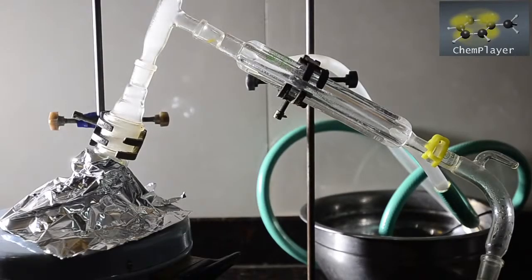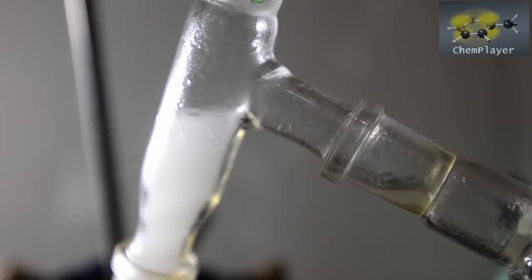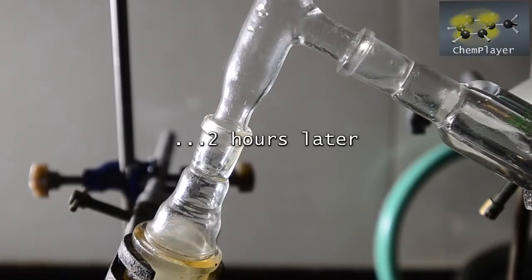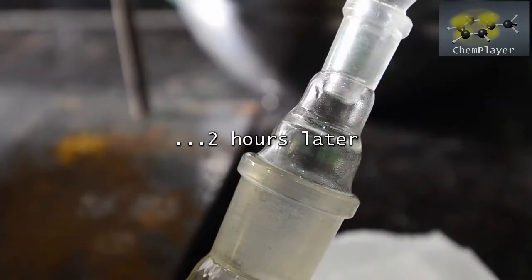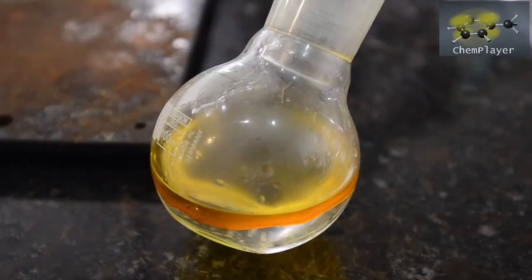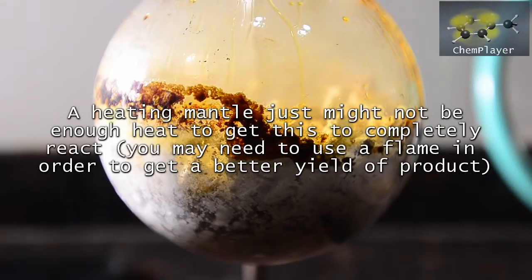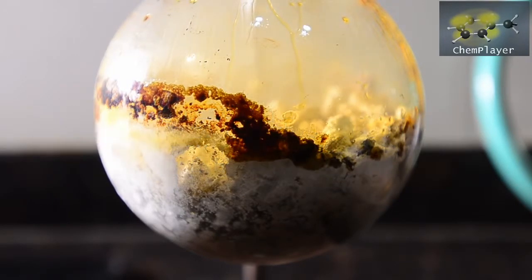After about an hour and a half the distillation starts to slow down, and after 2 hours there's no more distillate coming off. So at this point we stopped heating and allowed the apparatus to cool down. Here's our receiving flask. We can't help but think that there might be a lot more product potentially in the boiling flask, but it seems very difficult to get a strong enough heat on the entire contents. We might see if this reaction is more efficient on a smaller scale.